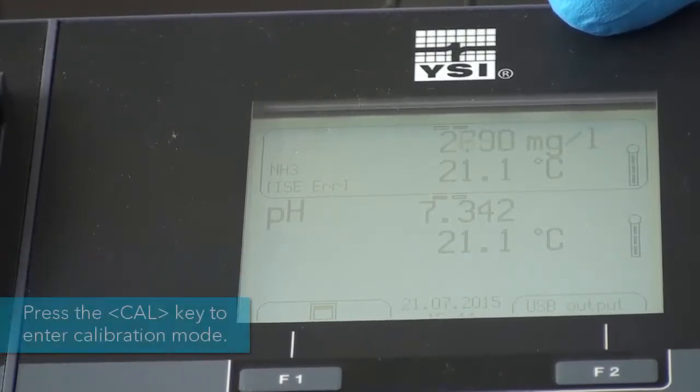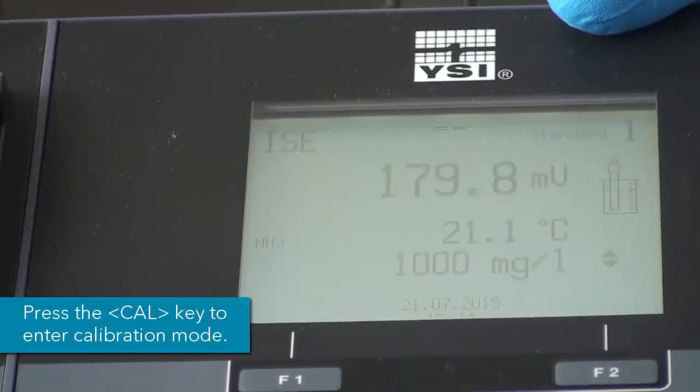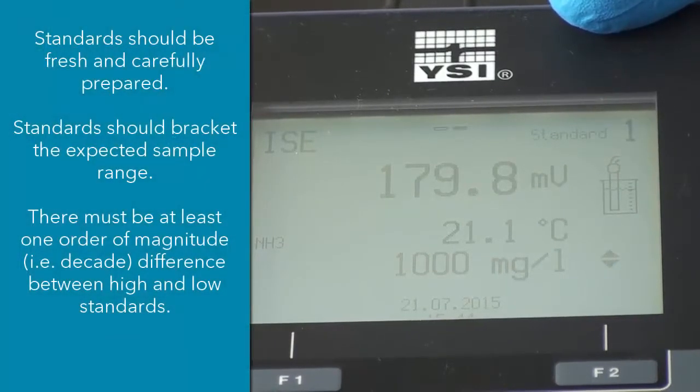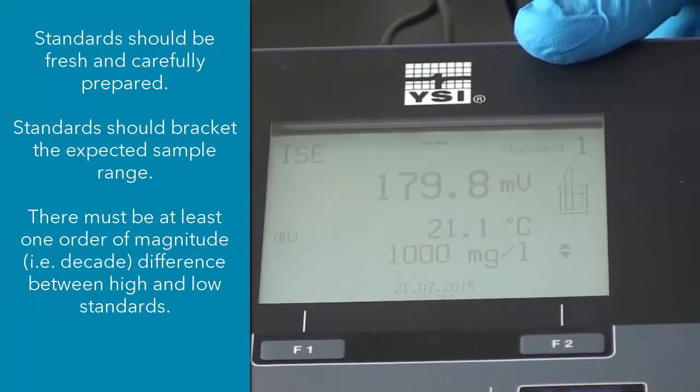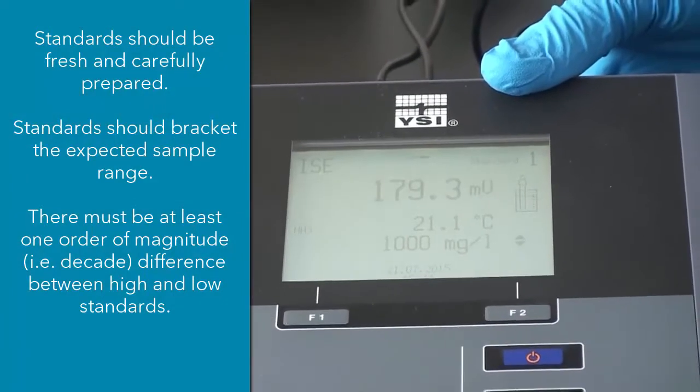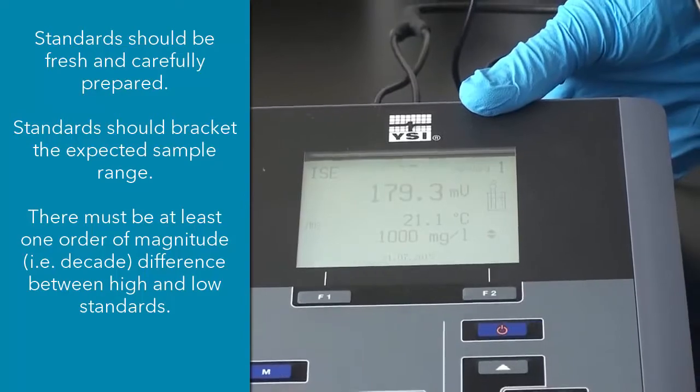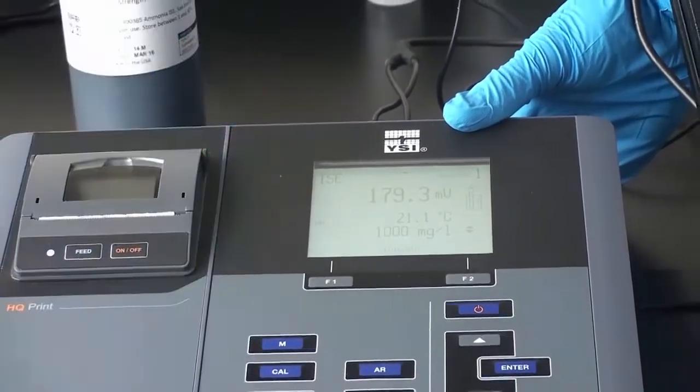So now we will want to go into the calibration mode. You will want to use standards that bracket your expected sample range. So I am going to calibrate using 10 mg per liter and 100 mg per liter standards. So that would work really well if your expected measurement was about 50 mg per liter.